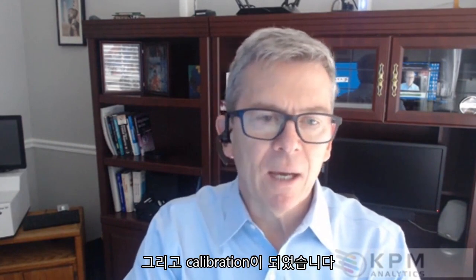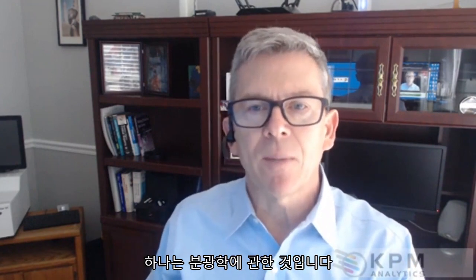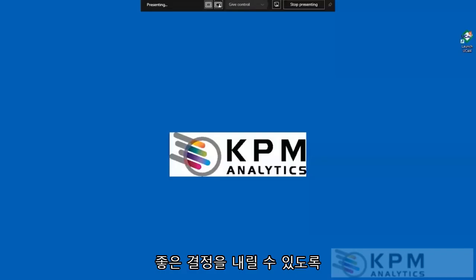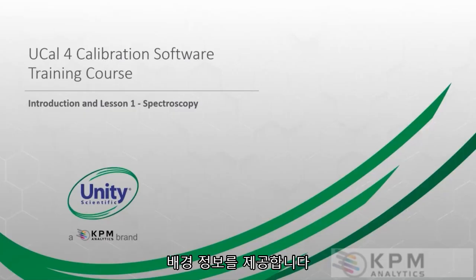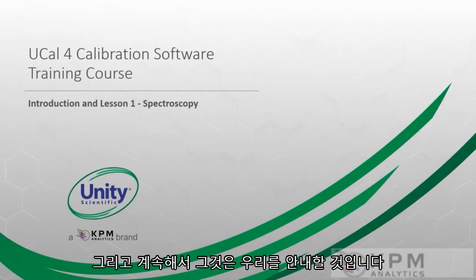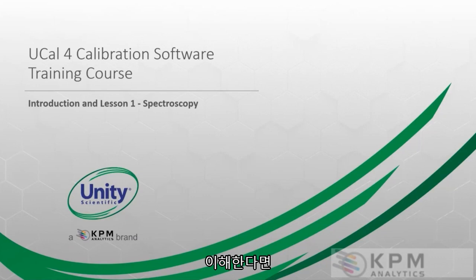Okay, with that, I'm going to jump into lesson one, and lesson one is going to be about spectroscopy. It gives us a little bit of the background so that we can hopefully make good decisions, and it will guide our calibration development. It also will help us be more efficient, because if we understand the principles of near-infrared and what's happening with our instruments and with our samples, it's going to help us make good decisions and get to our endpoint faster.